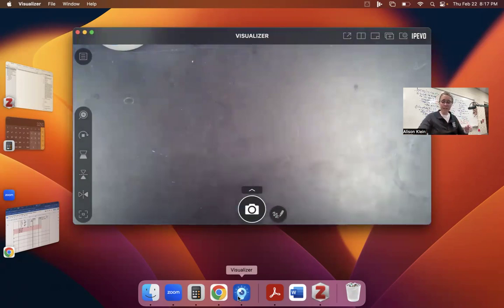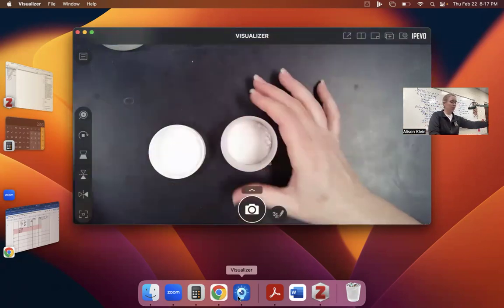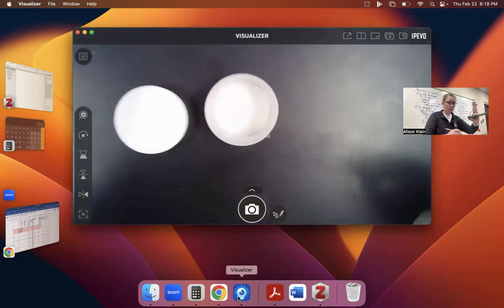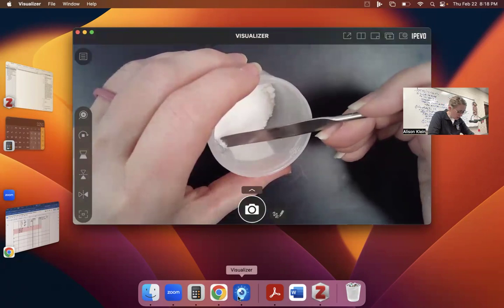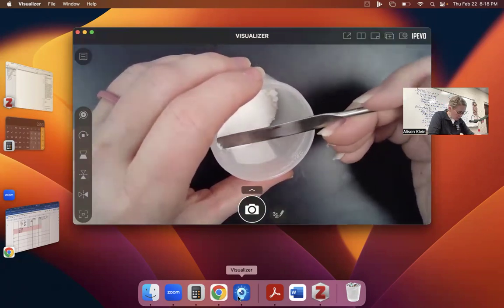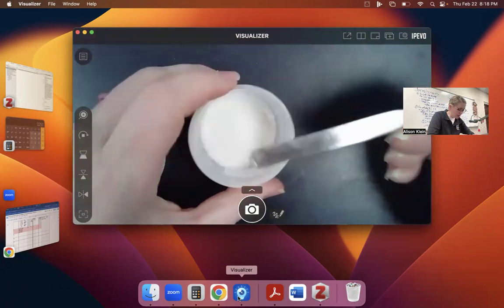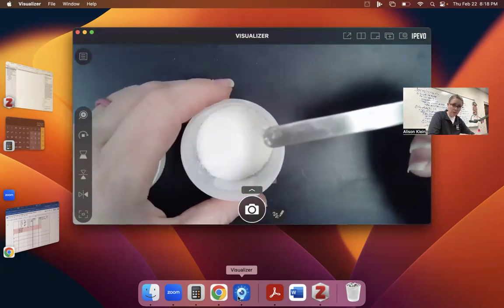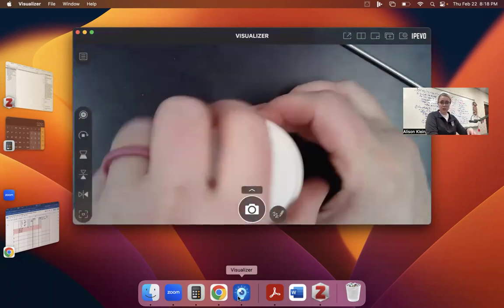So when you're getting a sample, like I had number 1 from yesterday, we want a countable number of crystals, right? Especially if my powder is small, I'm going to get the smallest countable number of crystals, and you're going to go through your procedure.